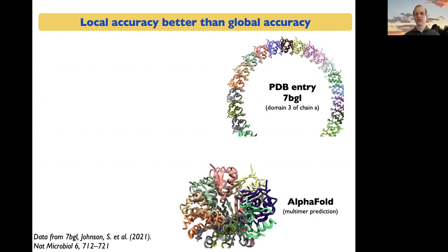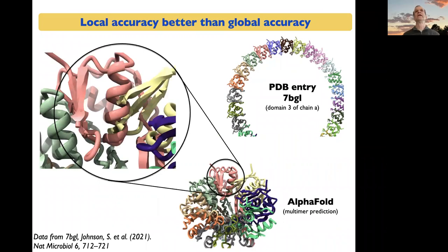If we look at contacts, we'll see that, well, doesn't look all that great. You know, one protomer that's like overlapping completely with another one. So this is not uncommon in AlphaFold predictions of large molecules, that longer distance relationships are not so good.